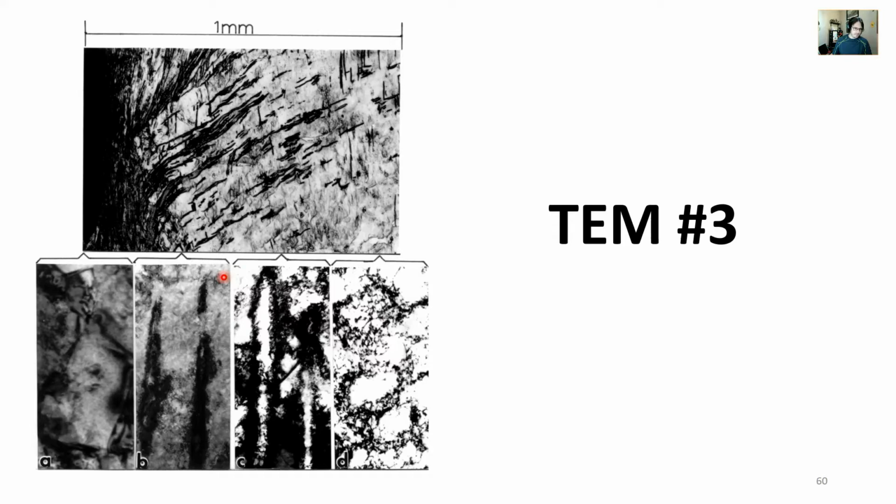Maybe it's not the best figure I've ever made, but it was showing schematically what kind of microstructures you get at different intervals away from the crater surface. So this is the edge of an impact crater surface. You see all these interesting microstructural features. Here you have heavily dynamically recrystallized grains. Here you see microbands, and here you again see microbands, but they have a slightly different morphology and they're somewhat bigger. And then further away from the crater surface, you get dislocation cells.